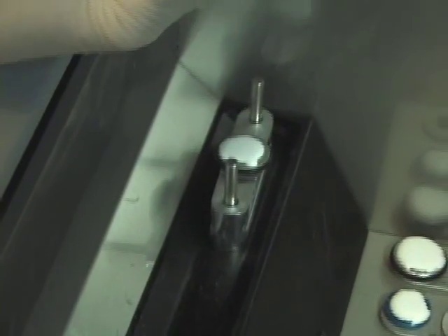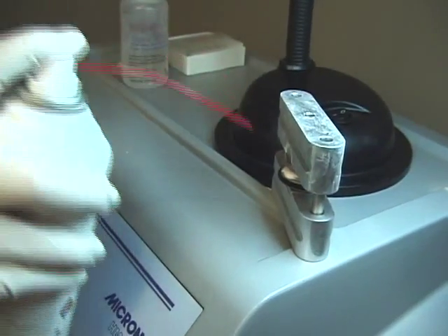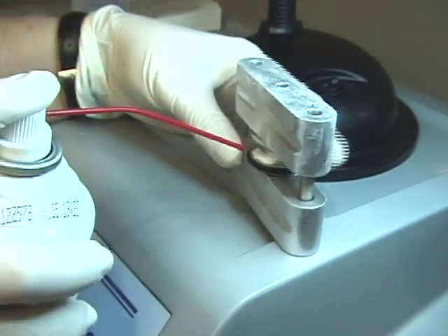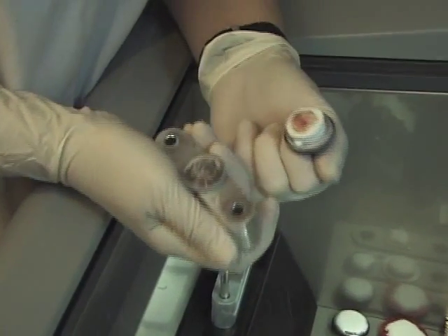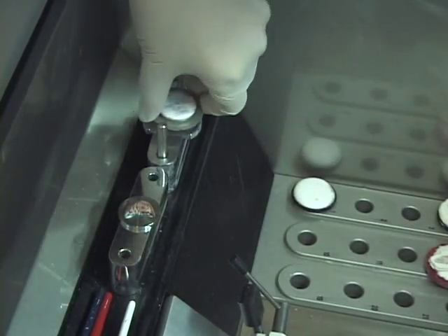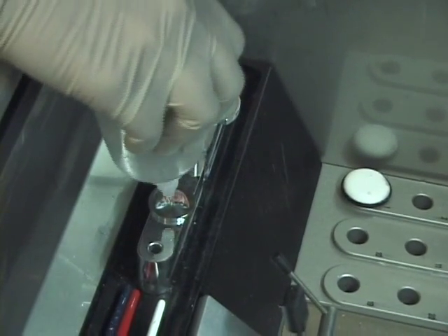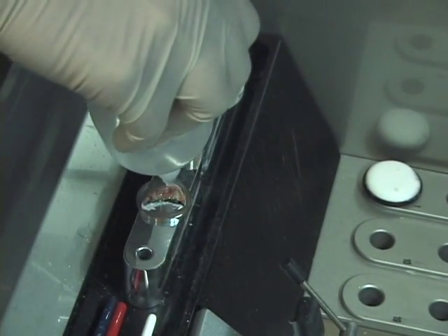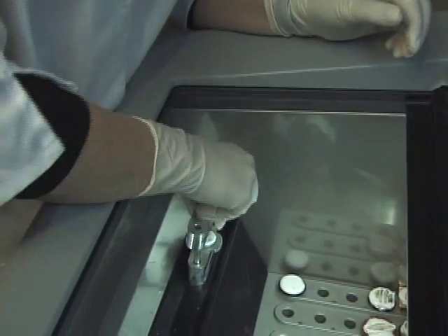The cryoembedder's design is ergonomically friendly. The discs are rotated and the specimens embedded without movements of the hands that cause carpal tunnel, so common to people in this profession. The smooth disc is easily removed from the cutting chucks without the need to partially thaw or twist, and they will never break or cut the technician, which can happen with glass slides. This adapter is used for the regular and large size Thermal-Shandon chucks. When using the cryoembedder to freeze and orient specimens, each specimen is lowered onto the posts at the same angle, so very little if any adjustment will be needed when cutting.